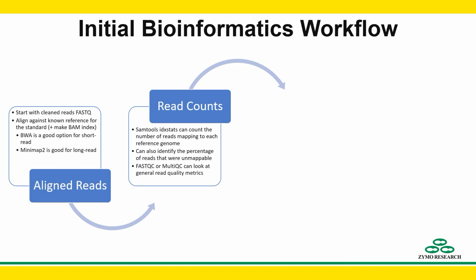Either one of those should be looked into to identify if there's a specific cause if you have an unacceptable percentage of unmappable reads. Another program to run on this is going to be FastQC or MultiQC.